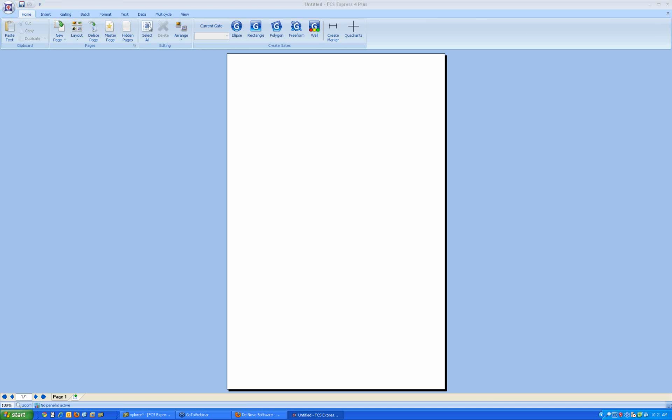And the new version works on Windows XP to Windows 7 and everything in between.